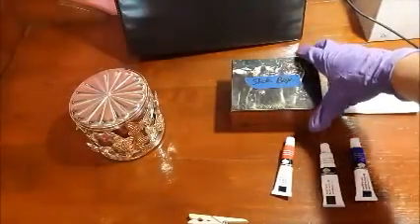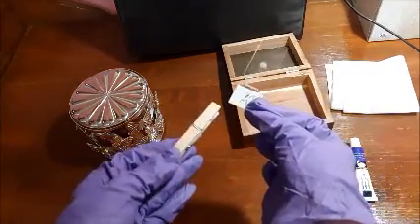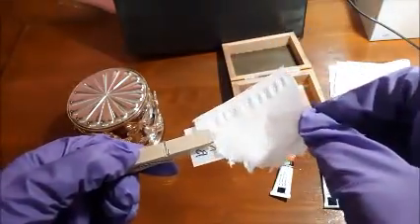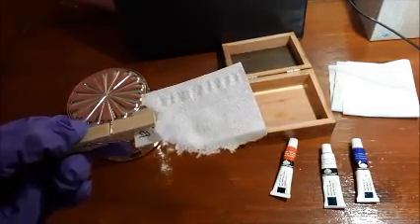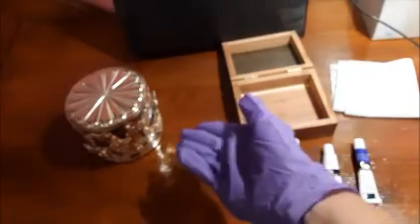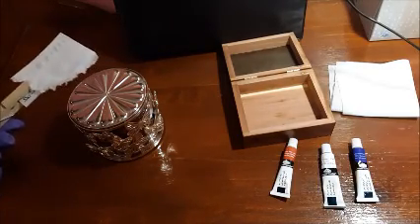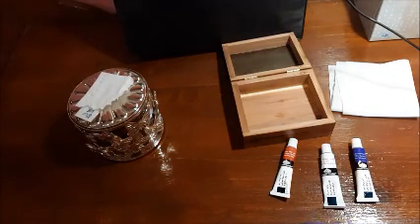So to start your experiment, you're going to take your slide out of your slide box, like so. And I'm going to hold on to it with the slide clip so that I can do other things in this experiment. Then you're going to rip out a piece of bibulous paper from your book of bibulous paper and put it on top of the smear, like so. Then you're going to place your heat fix slide with the bibulous paper over the steam bath. This is what I'm going to be using as my steam bath, this thing right here. If it was a real experiment, you would have a slide rack and all that. So, metaphorically, I will be putting it on the slide rack that's on the steam bath. Okay, I'm going to put my slide clip back down.